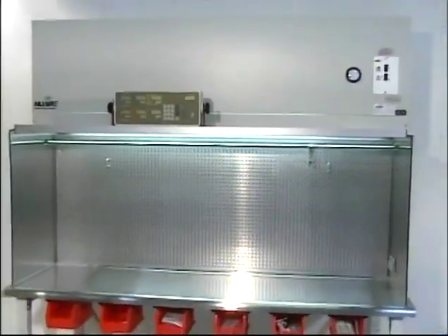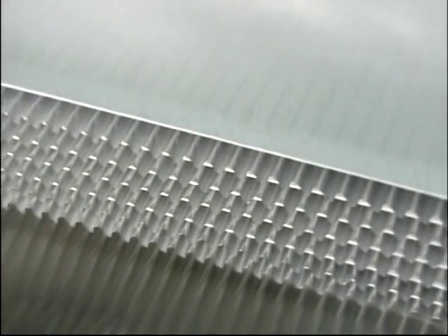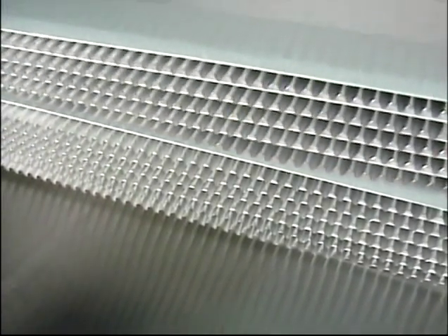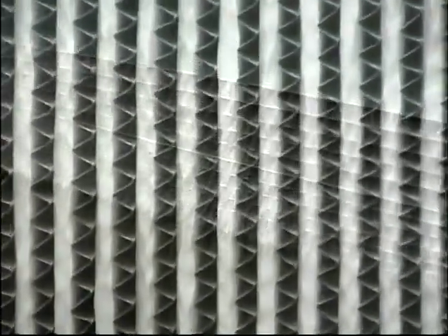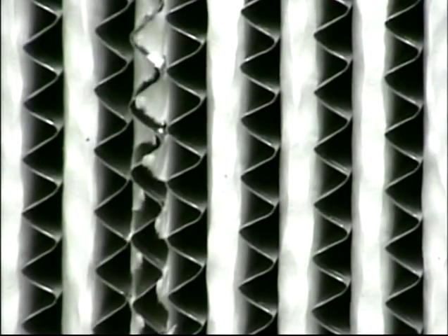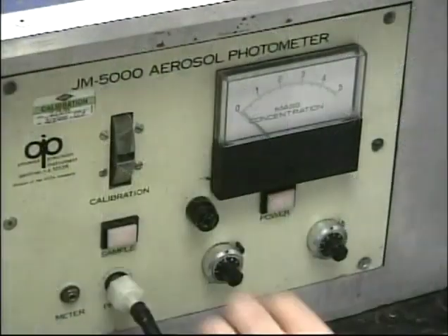The HEPA filter is normally constructed of a fiberboard frame with continuous neoprene gasketing. The filter medium is an extremely fine-pored paper-like material made of borosilicate glass, which is pleated around aluminum separators to greatly increase the filtration area. This medium is extremely delicate and is very easily damaged by the slightest touch, which can drive the separators through the rear pleats, causing a considerable leak. Leakage caused in this manner may not become evident until a filtration performance test is performed.